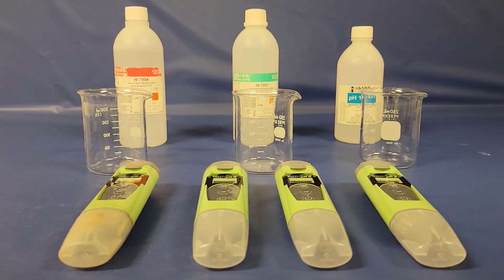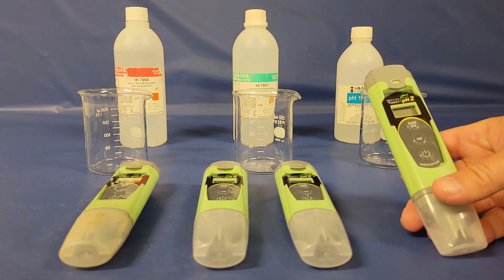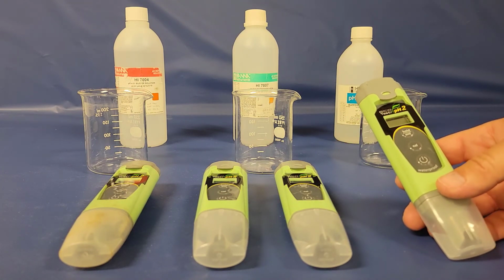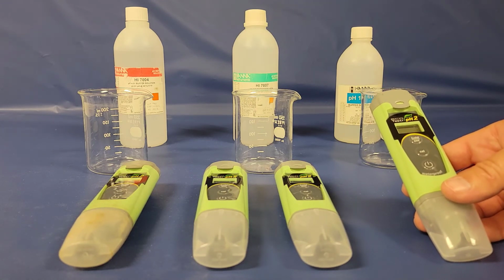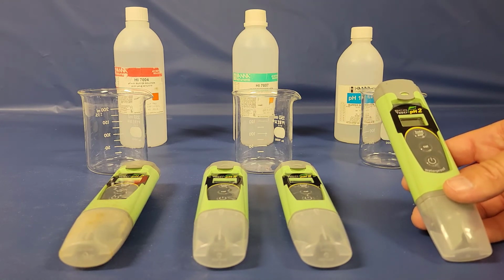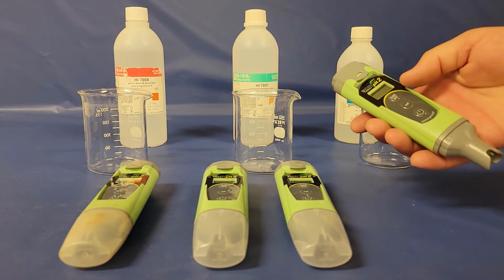All right, let's start by first calibrating our sensors. Today we're going to be using an Eco Tester pH 2. We've got several of them here. We want to verify that they're all working the same, so that way if we were to use more than one, we should get the same result. So this is widely available. You can buy them pretty much anywhere.